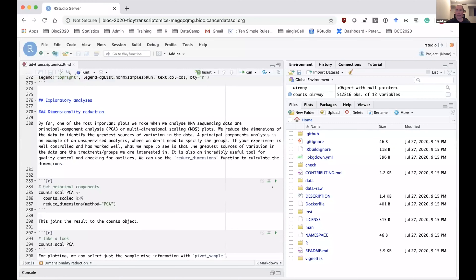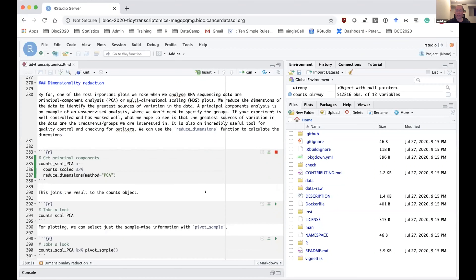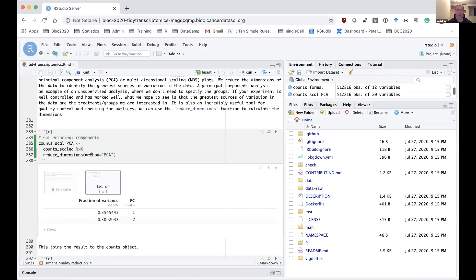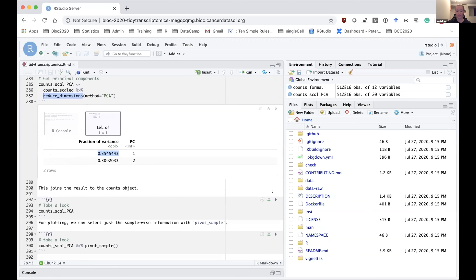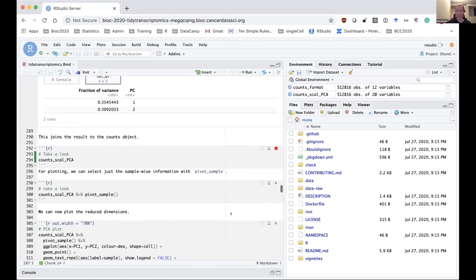Another plot we usually make with RNA sequencing analysis is a principal component plot or an MDS plot. We do this as an important quality control step — we want to see if there are any outliers in the data, any swapped samples, and whether our replicates are grouping together. Tidybulk enables performing PCA or MDS using its reduce_dimensions function. By default it outputs the first two principal components, and we can see the fraction of variance for each.